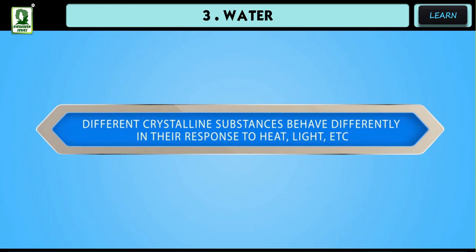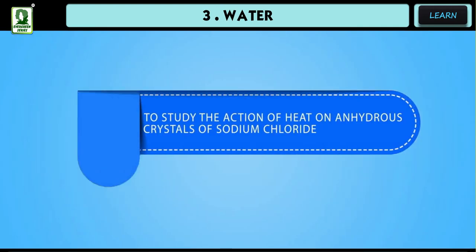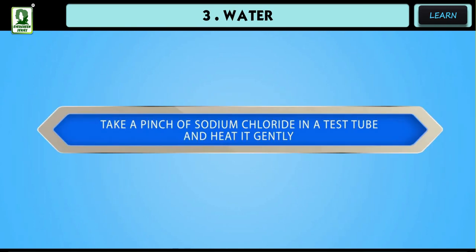Different crystalline substances behave differently in their response to heat, light, etc. To study the action of heat on anhydrous crystals of sodium chloride, take a pinch of sodium chloride in a test tube and heat it gently.